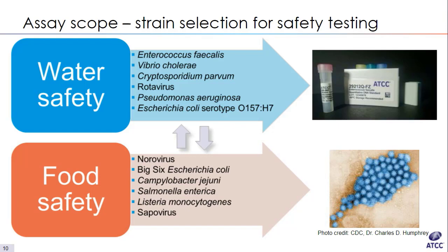There's also a bit of project history on this slide, in that it covers 3 of the first 4 molecular standards at ATCC. Pictured at top right is catalog 29212Q-FZ. This was a kit for Enterococcus faecalis strain Portland, cited by the EPA for water quality testing. This was made as a panel with serial dilutions and reagents included. It has since been simplified into a single vial with a DQ suffix, like the rest of the genomic standards.